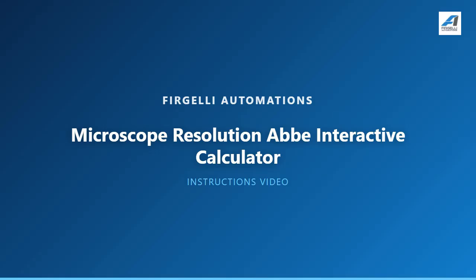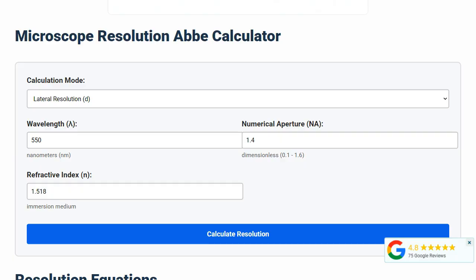To use this calculator, you'll need to enter a few key parameters. First, input the wavelength of light you're using in nanometers. For example, let's enter 550 nanometers for green light.